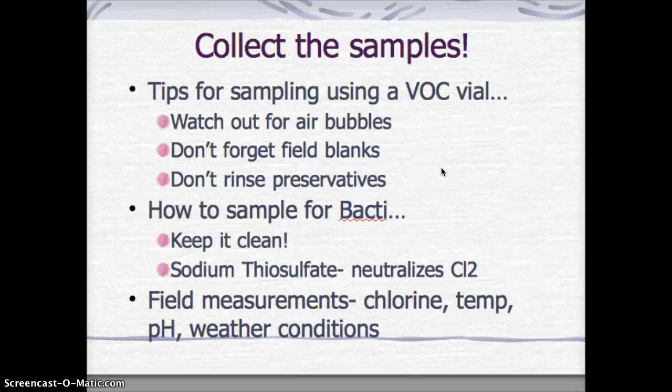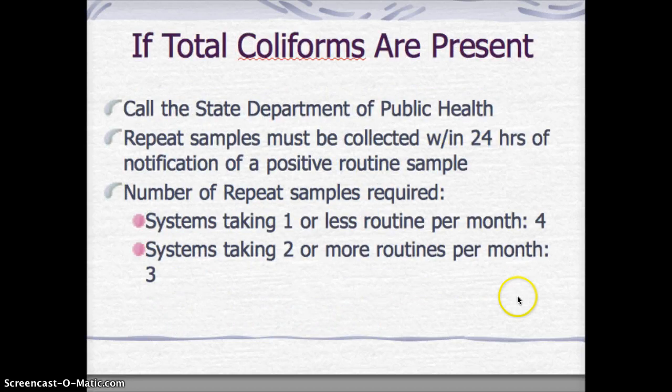And as we talked about before, some measurements need to be taken in the field, like chlorine, temp, pH, and weather conditions. And these things are required on the chain of custody form, so you want to make sure you pay attention to those in the field and not have to get to the lab and go, oops, I forgot to do the pH.